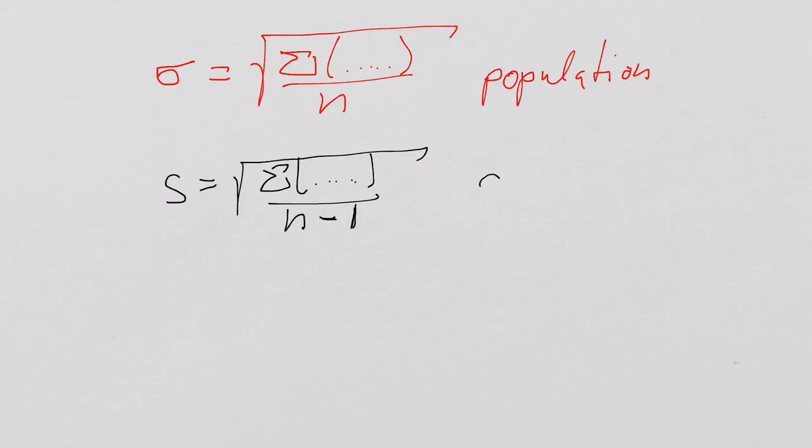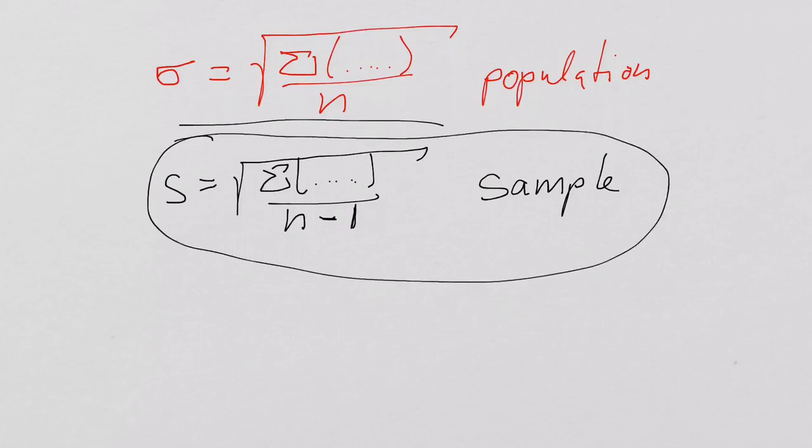So that is the sample standard deviation. I have given you in the protocol only the population standard deviation, but I think in hindsight it might make more sense to calculate it with the sample. Nevertheless, I will not penalize you for using either.